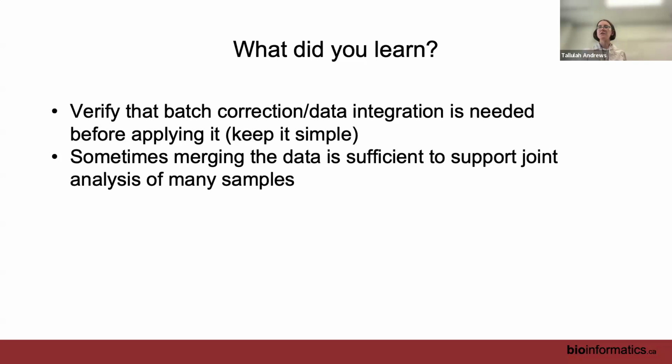Yeah, so I was asking, don't do batch effect correction before DE. Yeah, so you can do it before DE, but when you do your DE, you need to go back to the raw counts. So you need to save your raw counts somewhere so that you can always go back to them when you want to do differential expression.